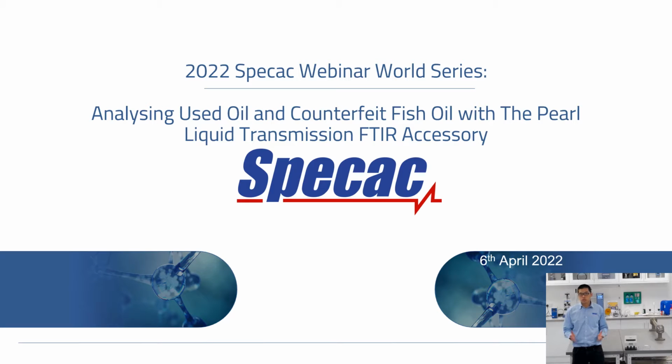We will be doing a series of webinars from April 2022 up until June 2022, and hopefully we'll be doing more throughout the year as well. So the first webinar will be looking at the analysis of used oil and counterfeit fish oil using the Pearl liquid transmission FTIR accessory. My name is Edmund Lo. I will be your speaker today.